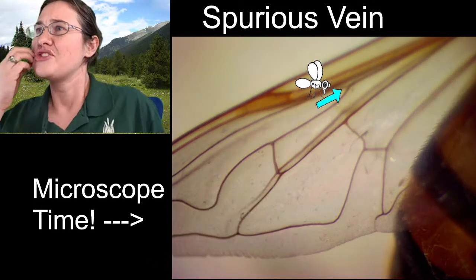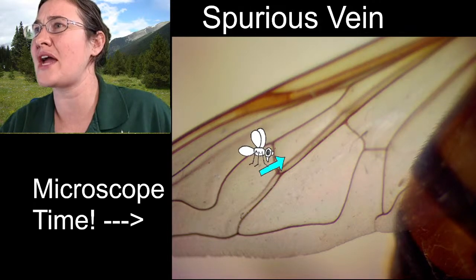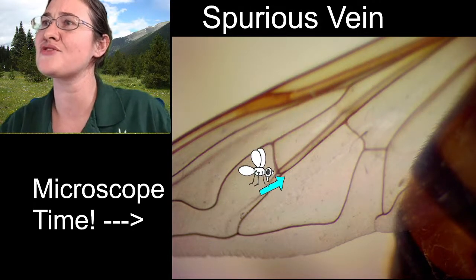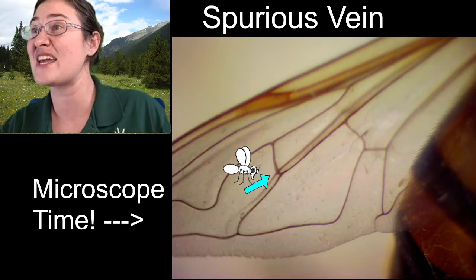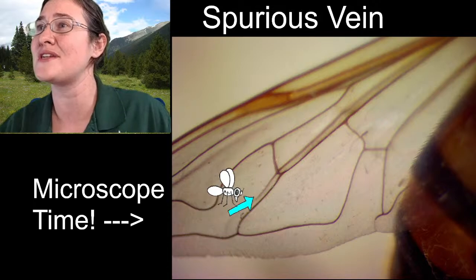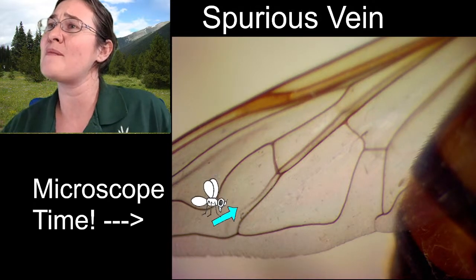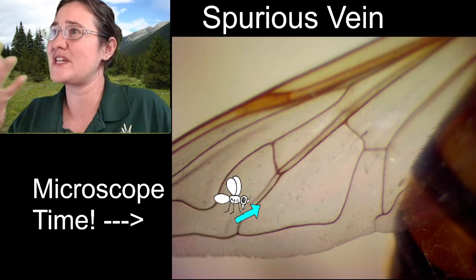All right, so you see this vein. This vein comes all the way up here. It kind of doubles. It crosses over this vein, right? But then it keeps going, and then it kind of just disappears into nothingness. It doesn't connect to anything. It just kind of disappears.